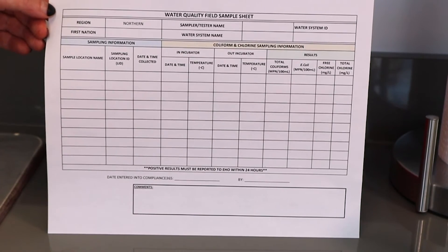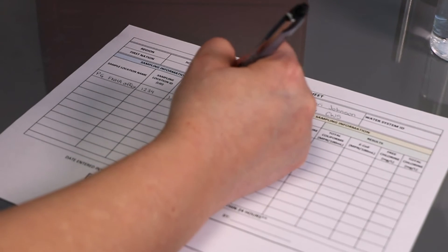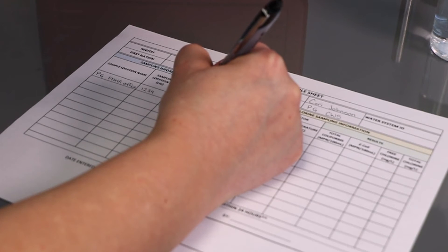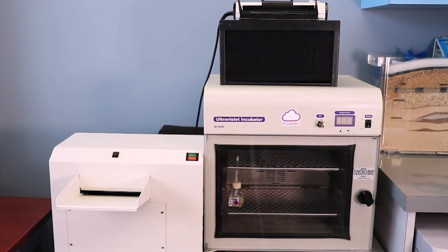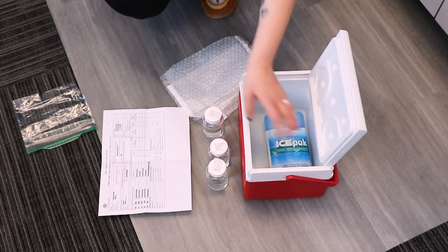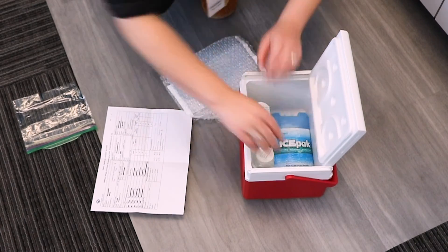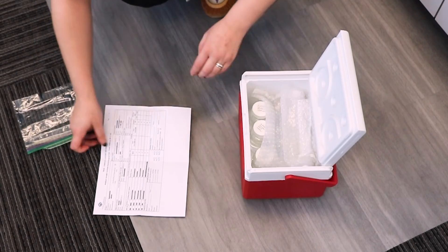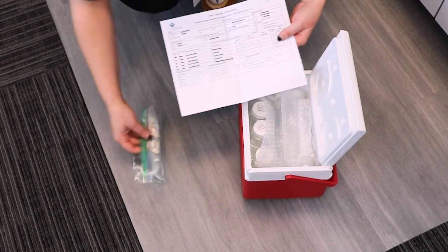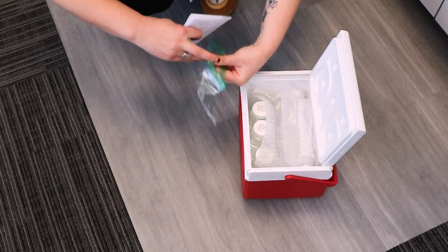Fill out your field sample data log sheet. You may want to pre-fill some of your data on your field data log sheet ahead of time. Once you have collected all your water samples, bring them to your community drinking water testing facility as soon as possible after sampling. You should perform your analysis within 24 hours of collecting the samples. If shipping samples to an accredited lab, fill out the chain of custody for the lab you are shipping to. Be sure the samples can be received by the lab within 30 hours of collecting the water sample. Keep the samples cool or refrigerated before analysis.